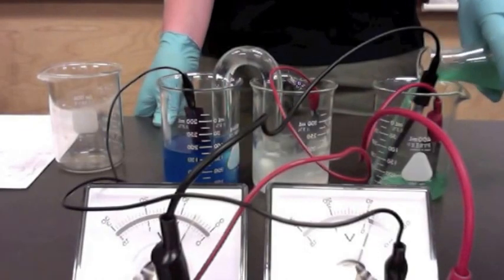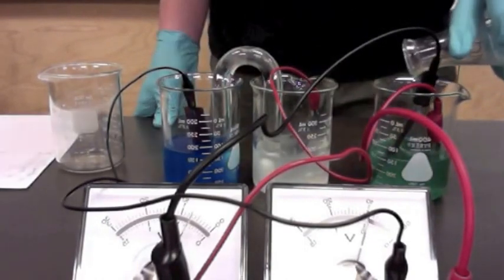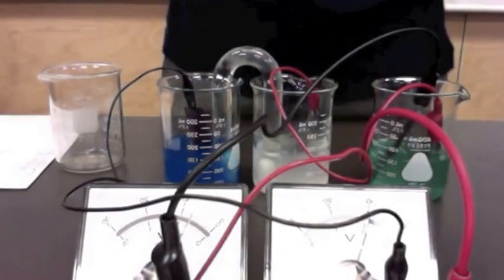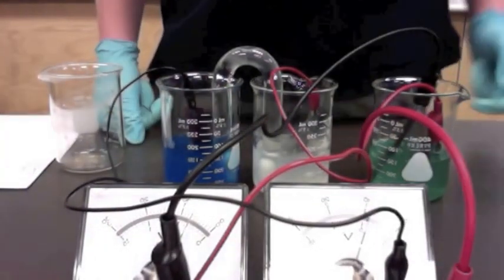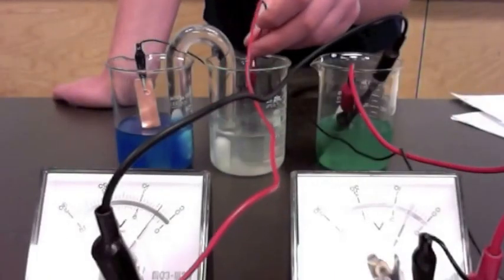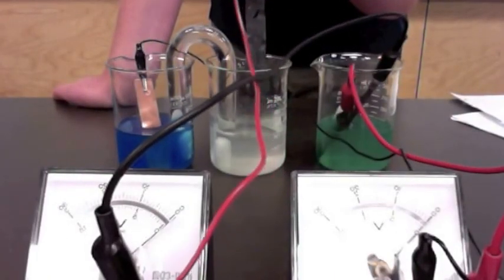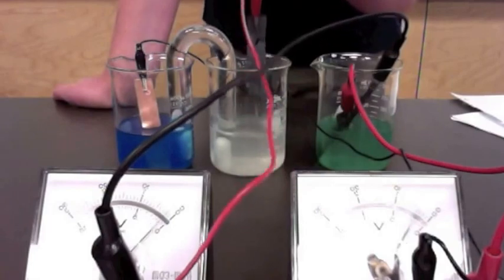So here you see me connecting the cell we made in the first step to an electrolytic cell. The electrolytic cell is non-spontaneous, meaning it requires energy to be inputted before it will work. So in this case, I'm using the energy provided by the electrochemical cell to power the electrolytic.